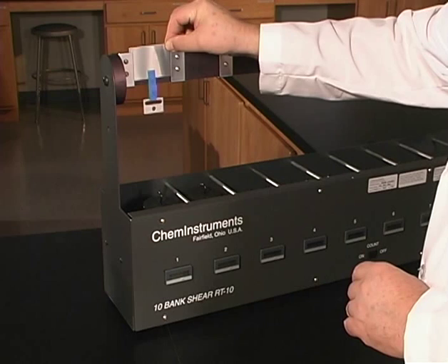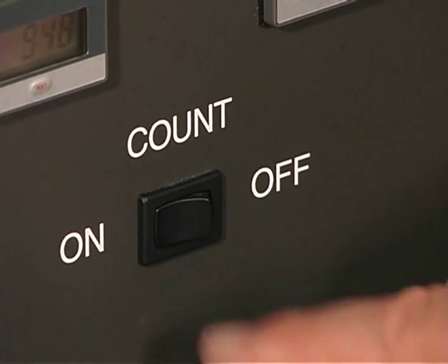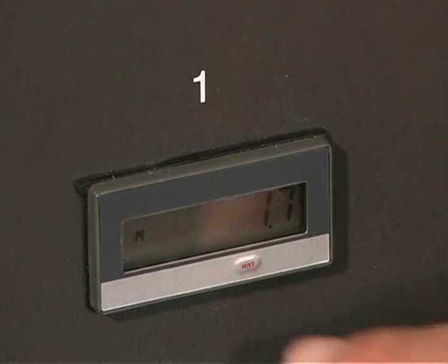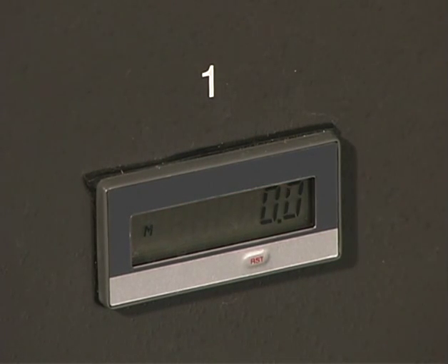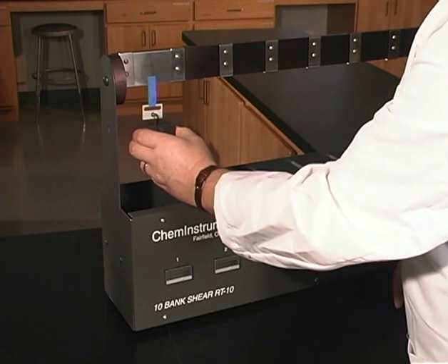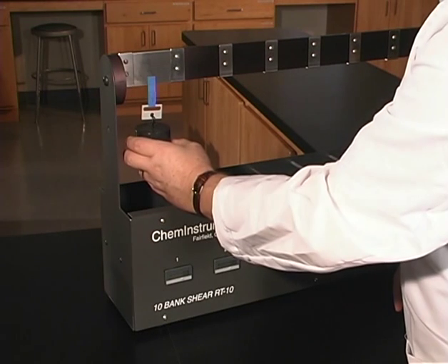Place the panel into the shear tester set for a vertical shear. Make certain the angle of the panel is such that no peel forces affect the sample. Reset the timer.